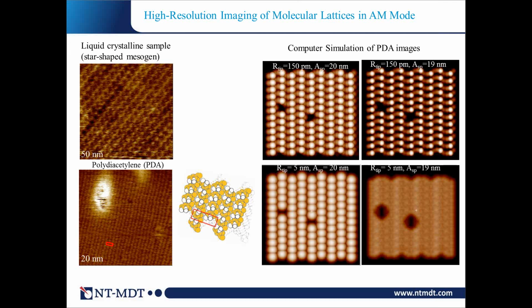That has been done in a few laboratories, and I would emphasize Professor Yamada's laboratory at Kyoto University, where they have done a lot of that in amplitude modulation and also frequency modulation mode. With a commercial instrument it is not yet a routine procedure, and I hope it will happen shortly. We are also doing a lot now to improve this resolution, and I hope in the nearest future we can show progress in this field.